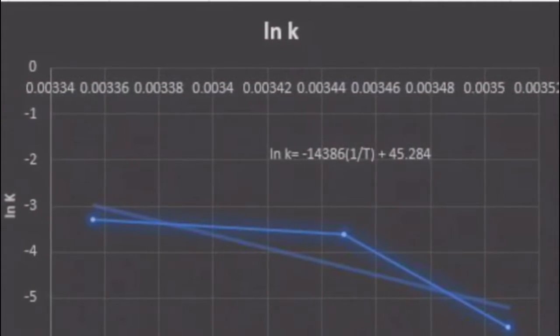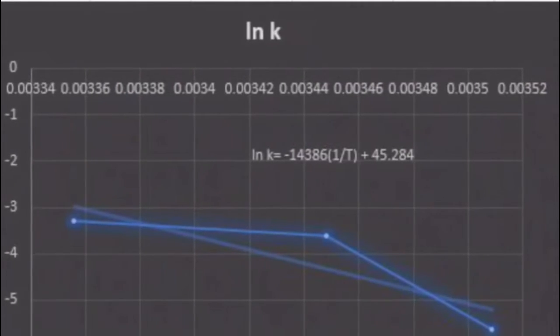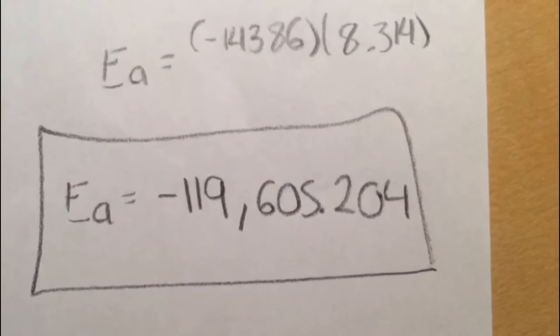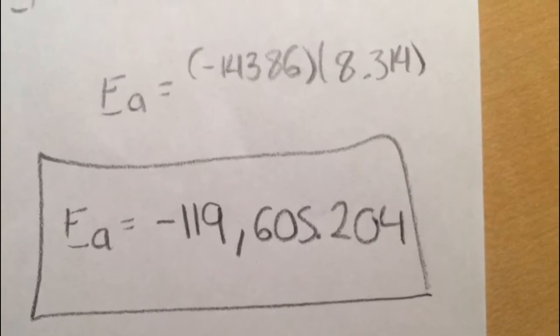And finally, when we get the equation for the graph, we could get the total amount of energy that was in the reaction. Our team concludes that the temperature directly affects the reaction time.